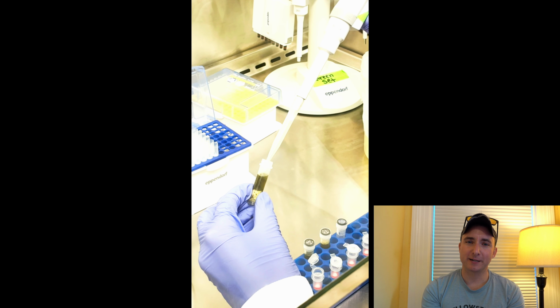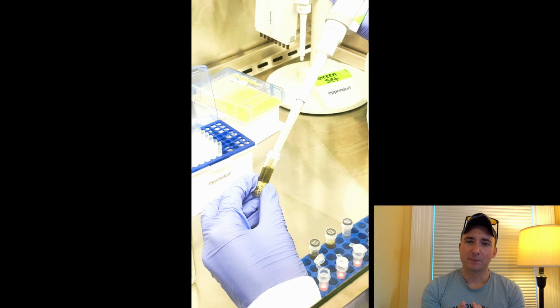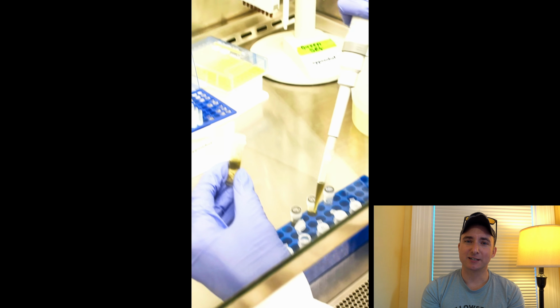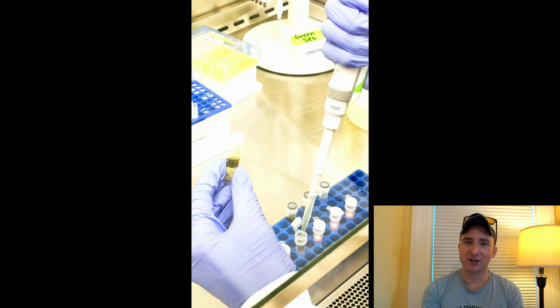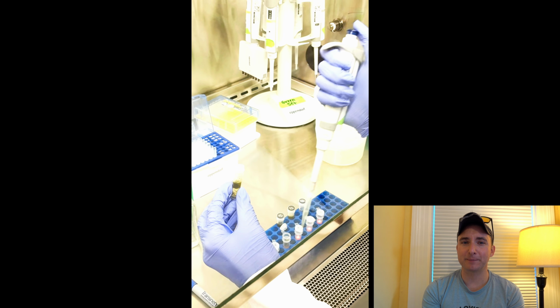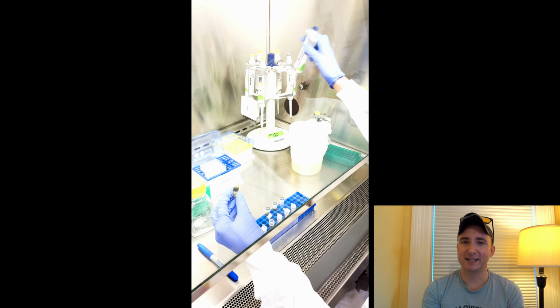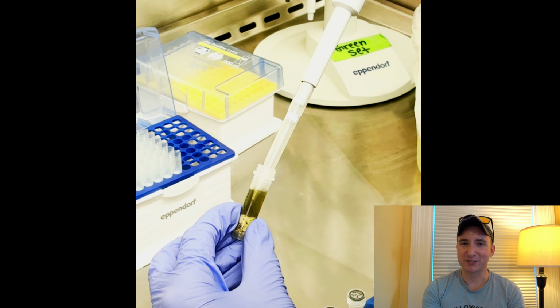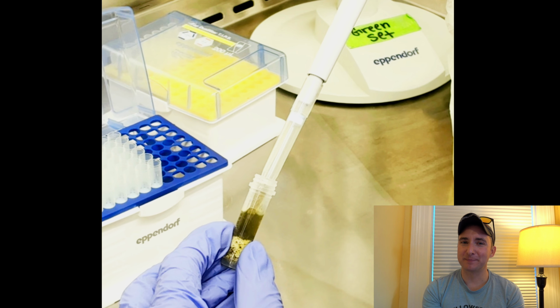But when you're working with environmental samples, you're often going to get mixtures that are very goopy, thick, dark, hard to see, with lots of debris in there. And you still have to find a way to separate liquid from the junk that you're supposed to leave behind. And that's hard.